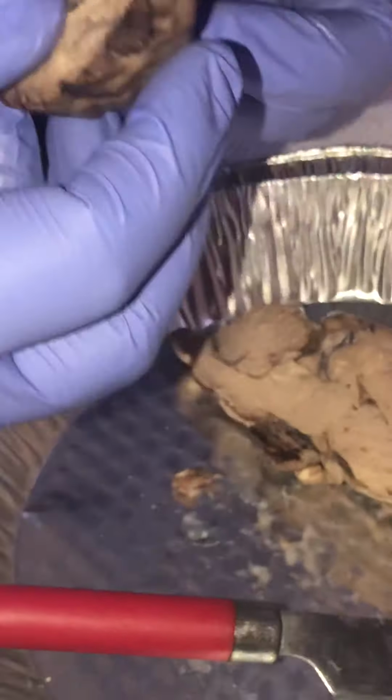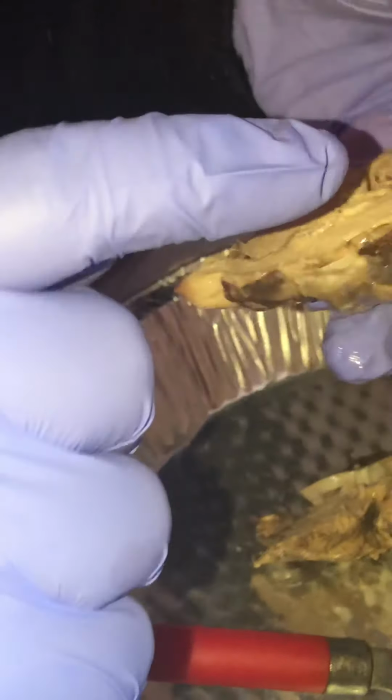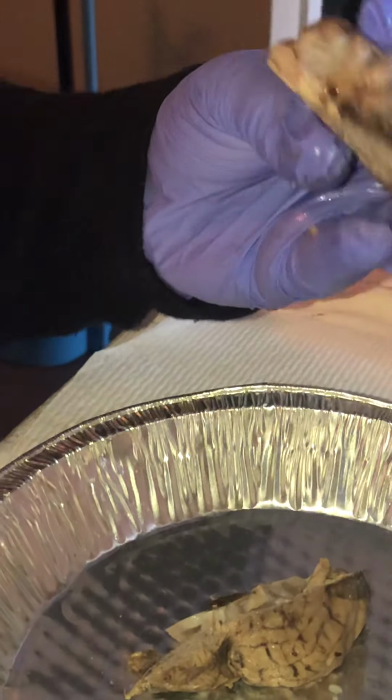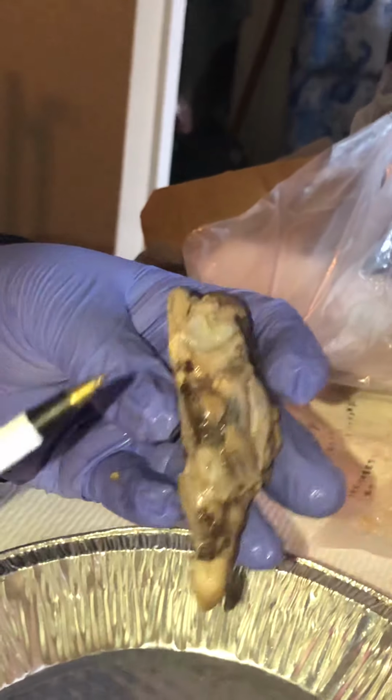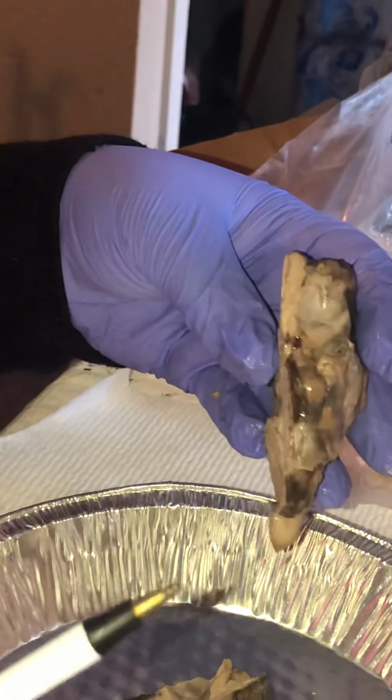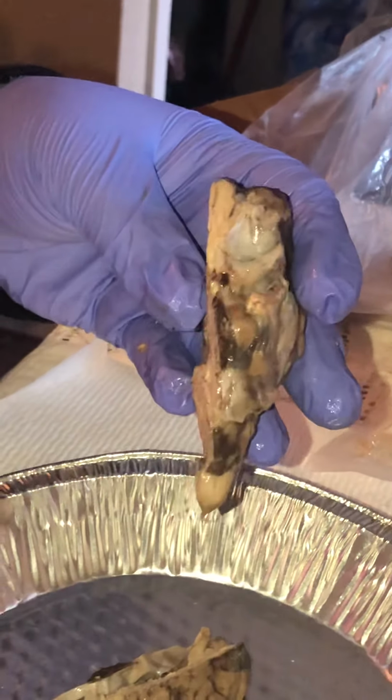Okay. So this right here is the optic chiasm. I'm not quite sure how we pronounce it. But that's a part of the optic nerve.